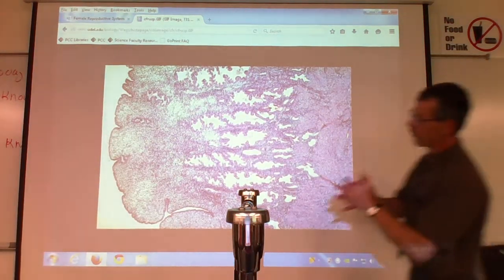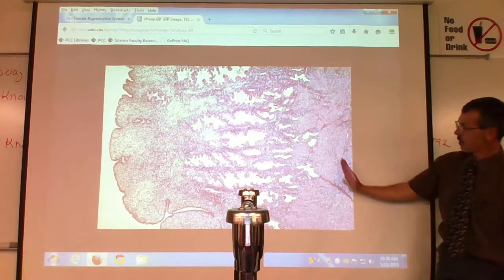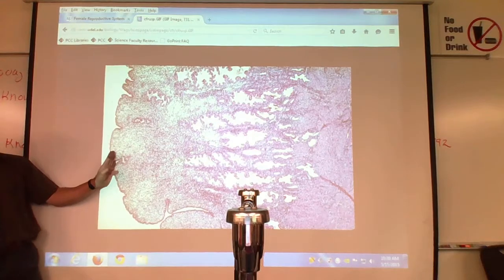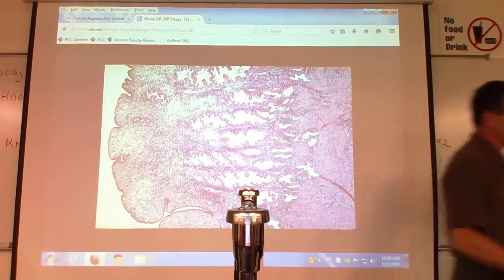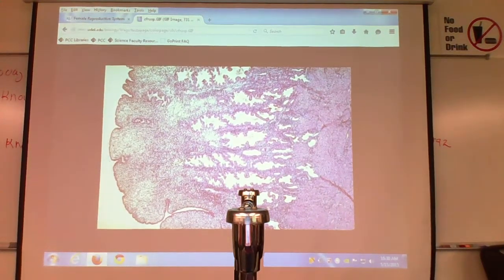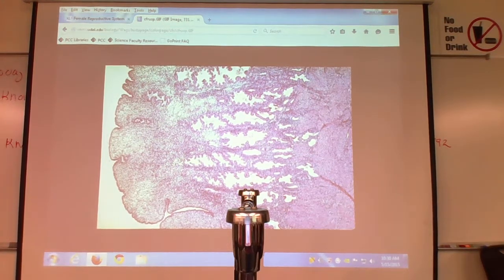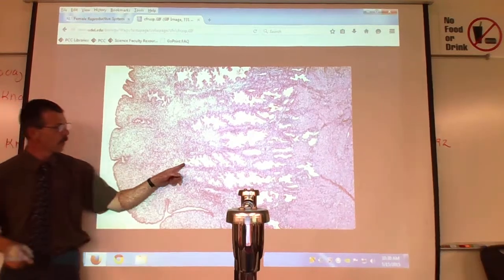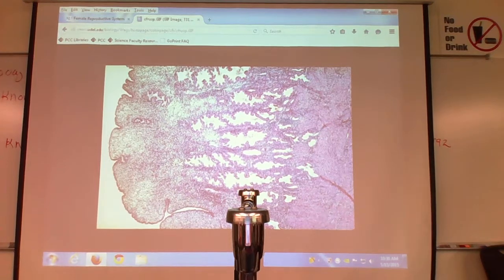Right. So we have uterus, we have endometrium, and myometrium. Then you look at the difference in the functional layer, from about here to about here. These represent the basal layer because they're changing density and color. There's no clear line in the sand between a basal and a functional layer, just kind of about here. Those are in the functional layer. So it's just the way it is.